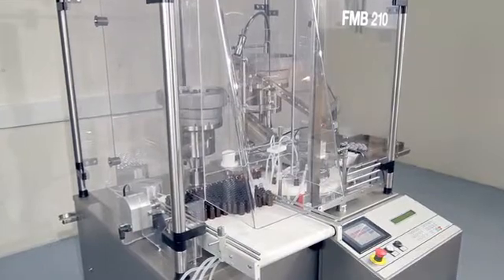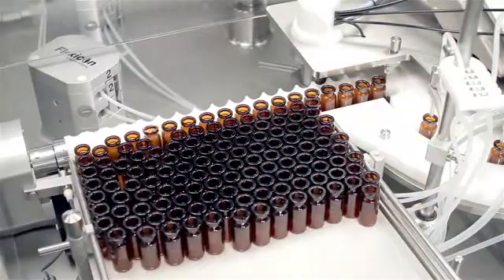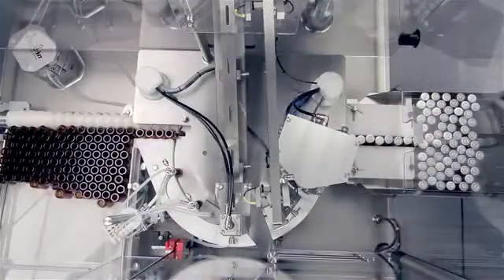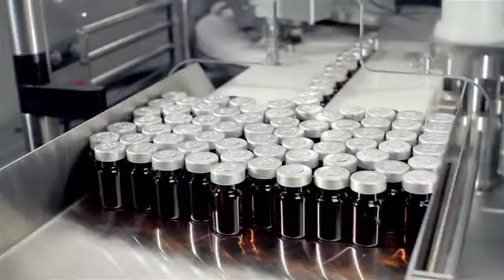The FMB210 is perfect for small to medium sized batch runs. Depending upon fill volume, the machine can process up to 4500 vials per hour.